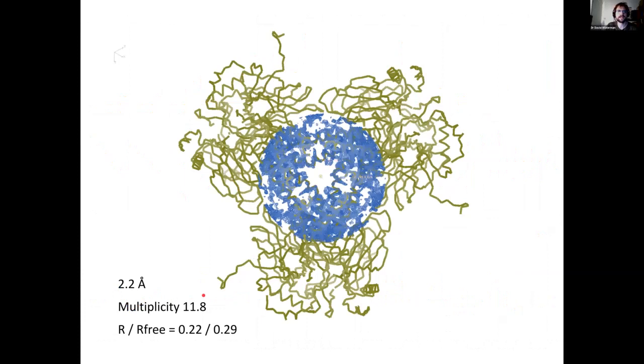So final data set in this case had a high multiplicity of 12 times which is helped by the cubic symmetry of the crystals and here's a view of the biological assembly with the potential map and of course this wasn't as high resolution as the serial ED structure but I still think it's quite remarkable that you could obtain this structure from 22 nanocrystals and over a total of 260 diffraction images and only about 200,000 unit cells diffracting in total.